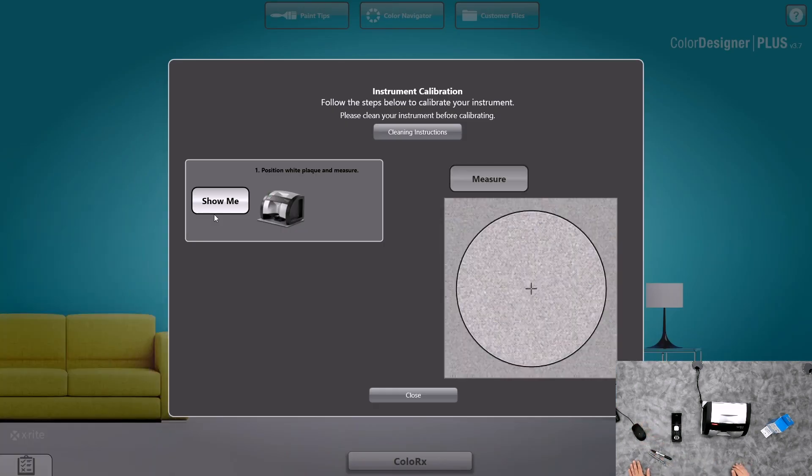You'll notice that the software has a cleaning instructions video. It also has videos on how to do proper techniques. But today, what we want to do is walk through the simple and easy calibration.